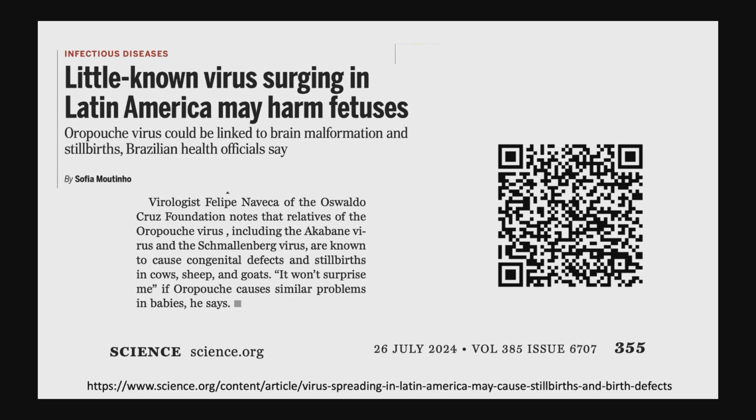So with the genomic surveillance, we were able to recover much more information than we had using other tools for classical epidemiology.